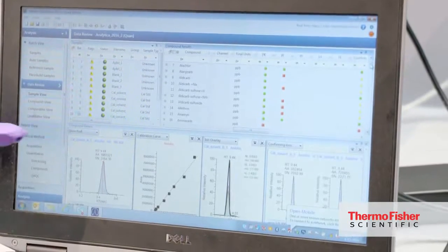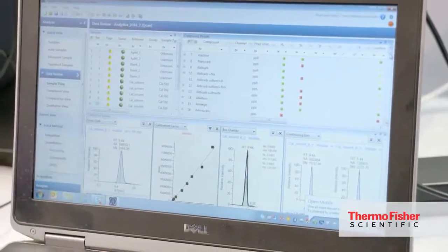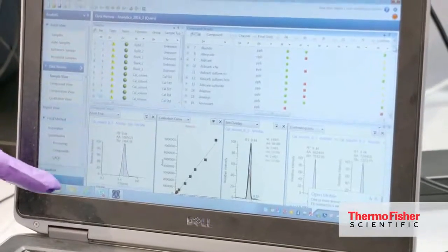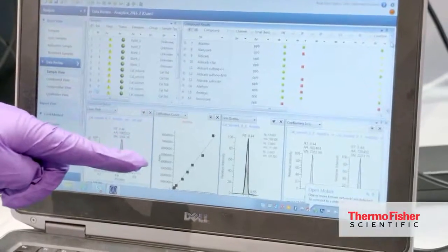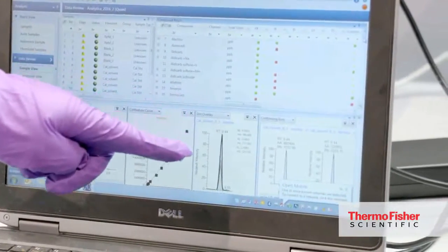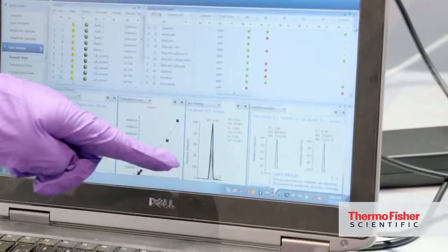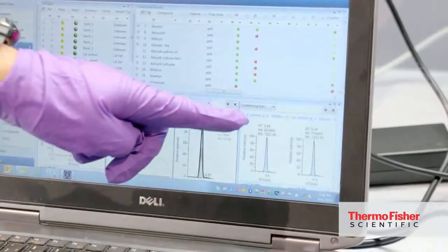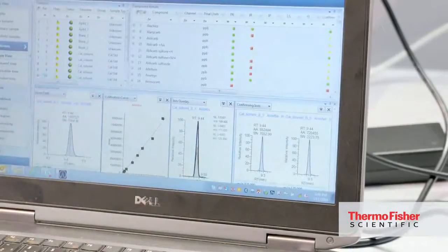And also you have the flagging system, but more interesting are really the pictures showing the quantitative peak, the calibration curve, and the confirmation ions overlaid with the main peak. And you see also the confirmation ions in a separate window.